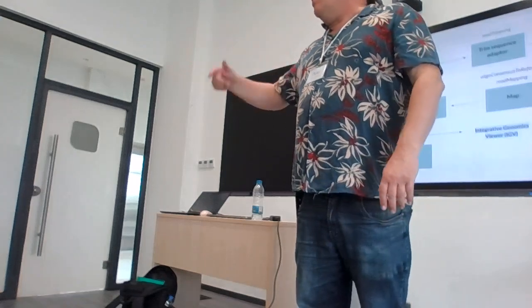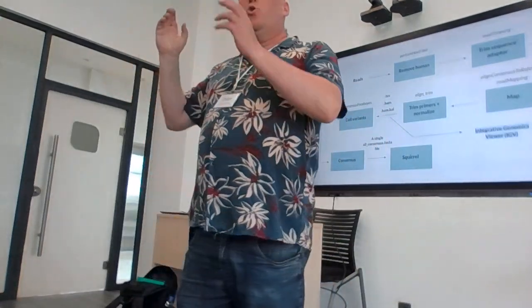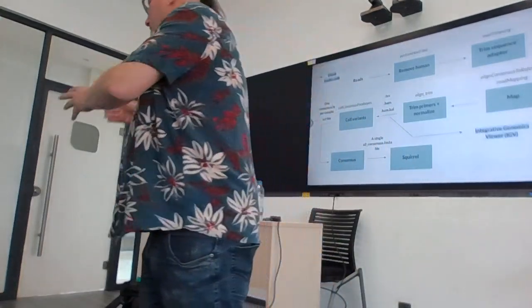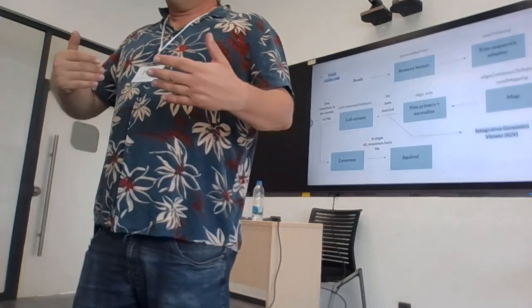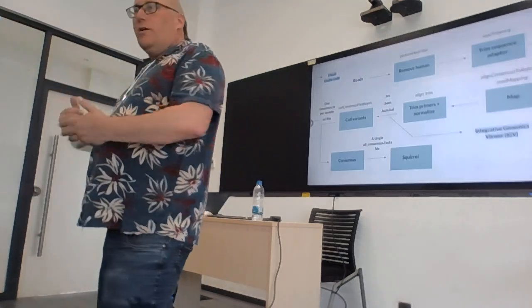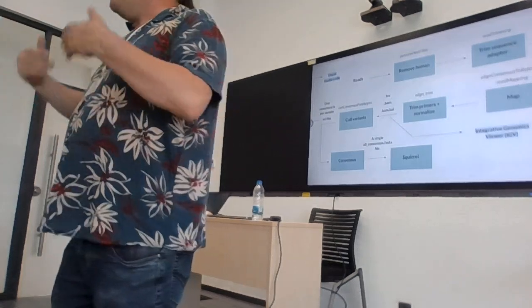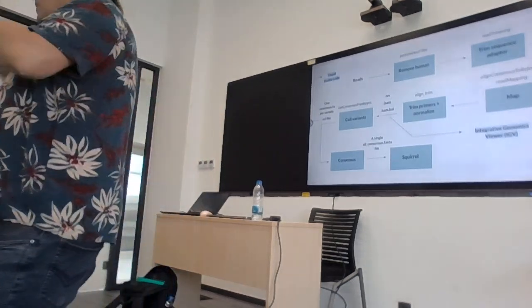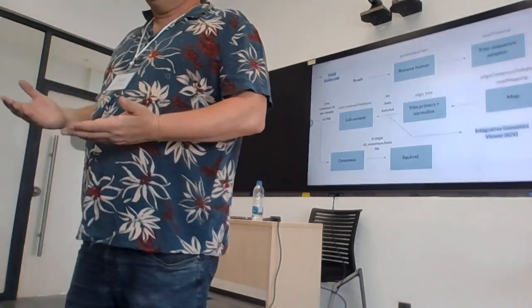Next week, you will break into groups of 2 and do projects together where you do data analysis together. So you'll have more experience. We're going to move away from EPI2ME now, and you're going to get back to it next week when you do your projects, okay? But even if you were to leave today and go back to your country, you would be in a position to analyze the data that you sequenced, okay?